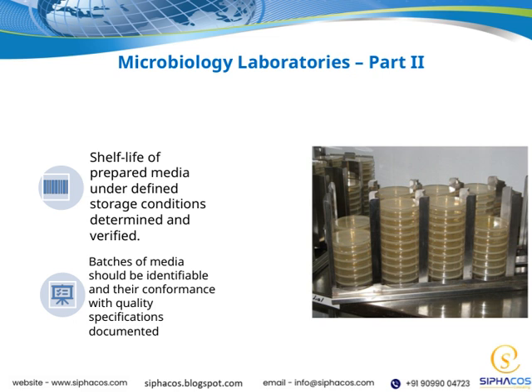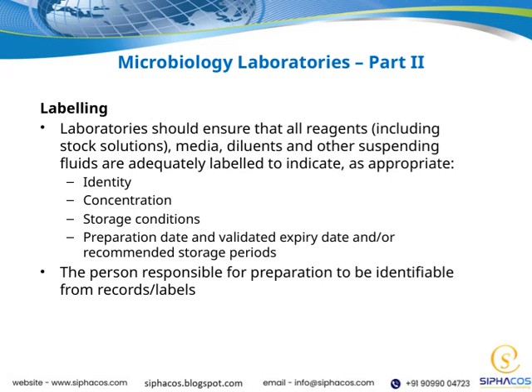We'll also look at the importance of maintaining strict safety protocols to prevent contamination and ensure the safety of lab personnel. Remember, the accuracy of laboratory results directly impacts patient outcomes, so attention to detail and quality control are paramount. By connecting these points, we see how microbiology labs are integral to the broader healthcare system, supporting both diagnosis and research. Let's talk about labeling in the microbiology laboratory.